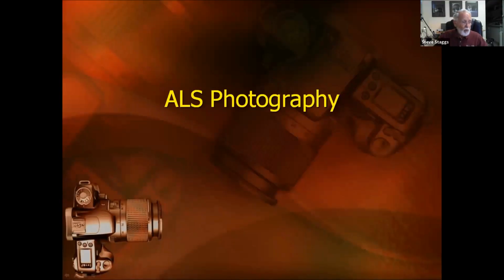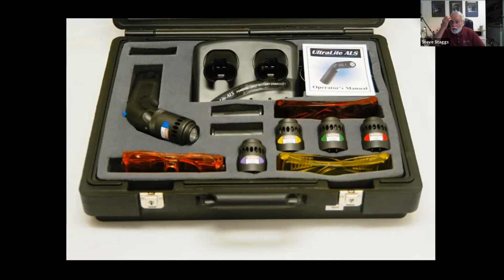Let's move on to some more about evidence, and let's talk about using an alternate light source with our photography. So ALS in our profession stands for alternate light source. Often we call them forensic light sources. The alternate light source you see us use most of the time is the blue light. It helps us to find evidence.